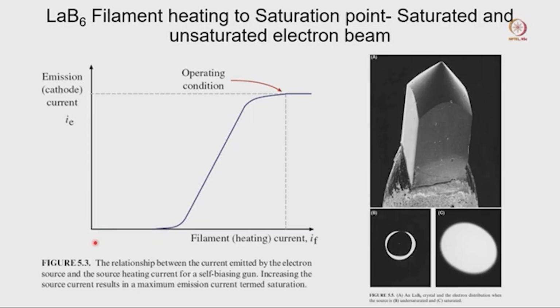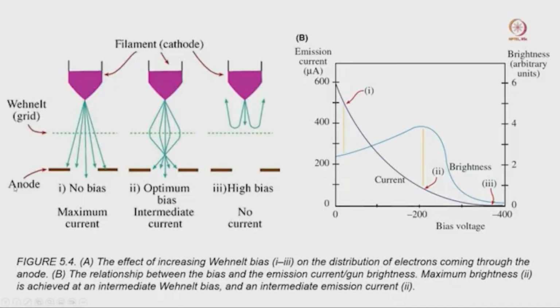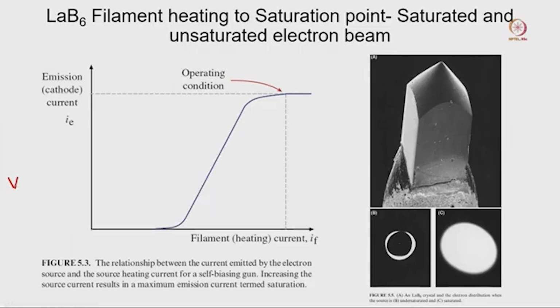Most of the time I am talking about the tungsten filament. For the tungsten filament we need this kind of heat energy.